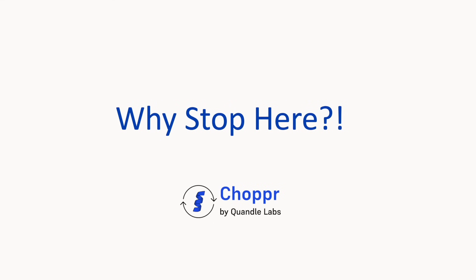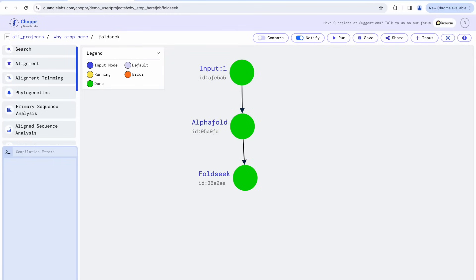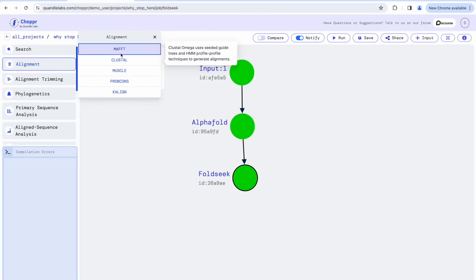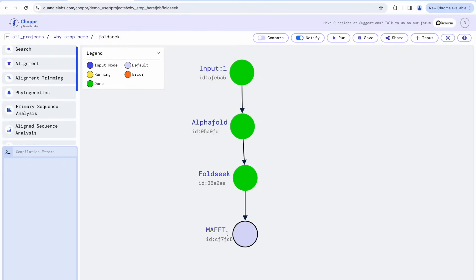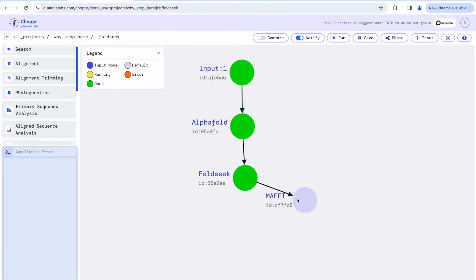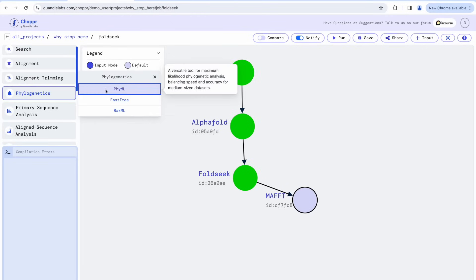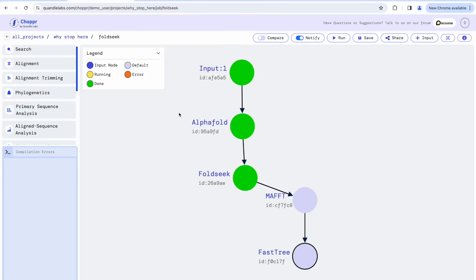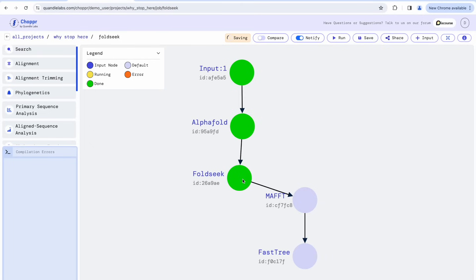But why stop here? Let's use the results from FoldSeq to create a phylogenetic tree. We will use MAFT to align the sequences and FastTree to create the tree. Again, to run a tool, simply click on it in the left panel and connect it to its parent node.